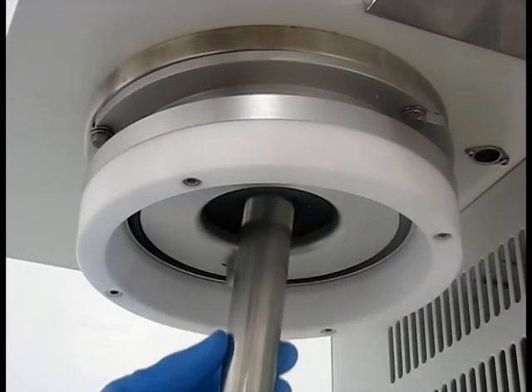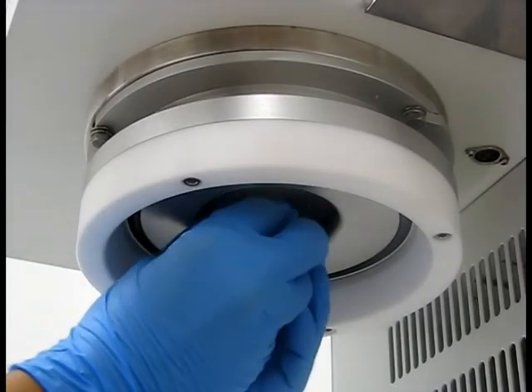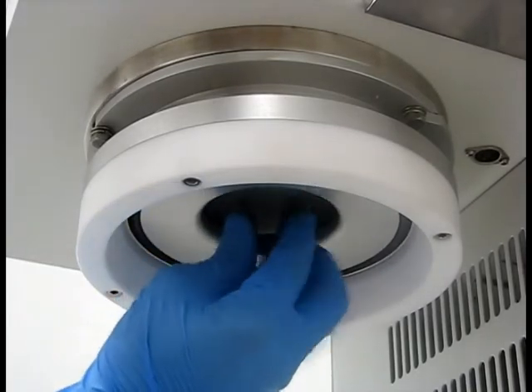Locate the nozzle guide pipe and carefully insert it into the air distributor. Use extreme caution when screwing in the pipe, as the honeycomb is very delicate.